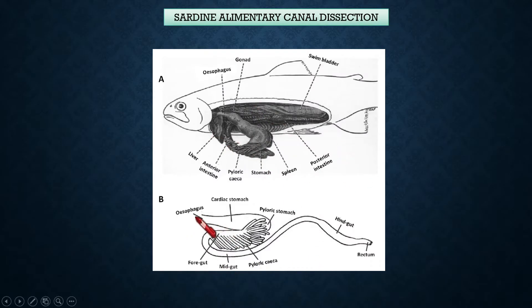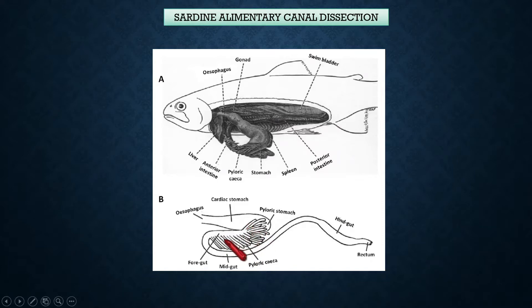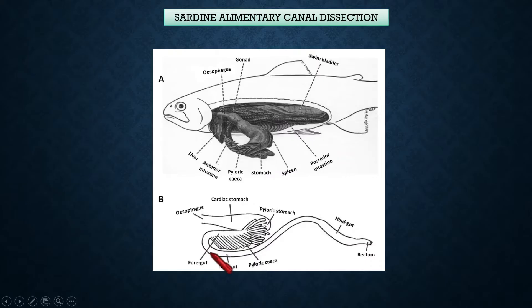The alimentary canal starts from the esophagus, then the stomach — which has a cardiac part and a pyloric part. Also very significantly, it presents a bend, which is a notable feature. Attached to the pyloric stomach are many finger-like structures called the pyloric caeca. The role of the pyloric caeca is to secrete enzymes that help the fish digest its food.